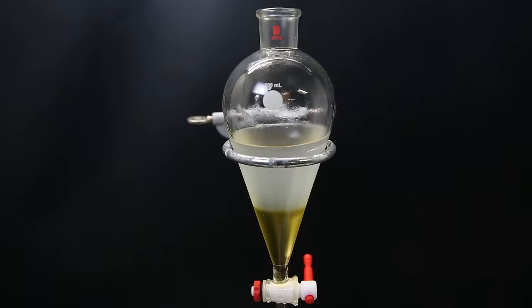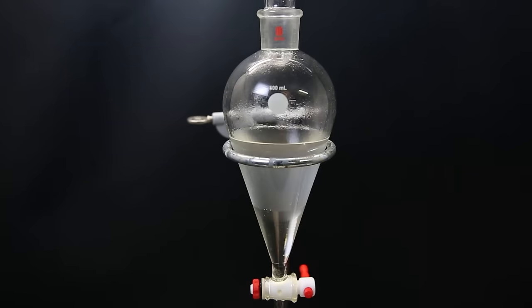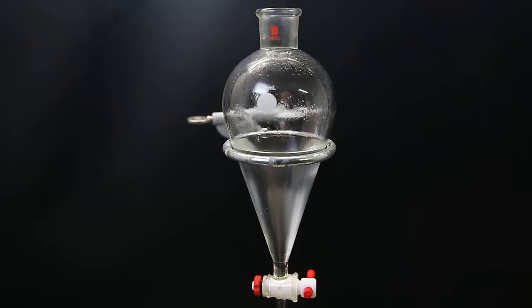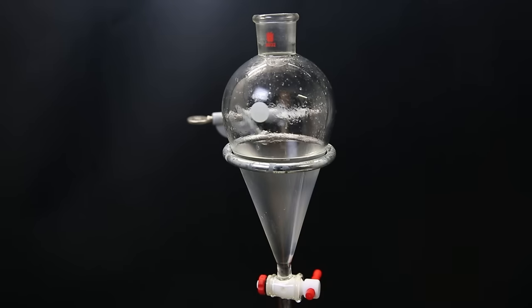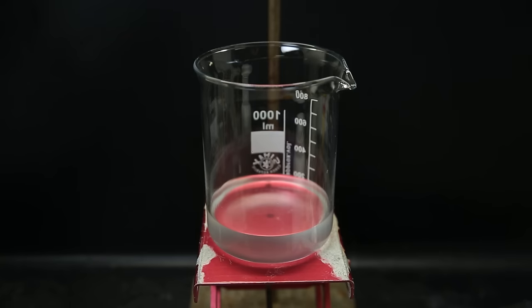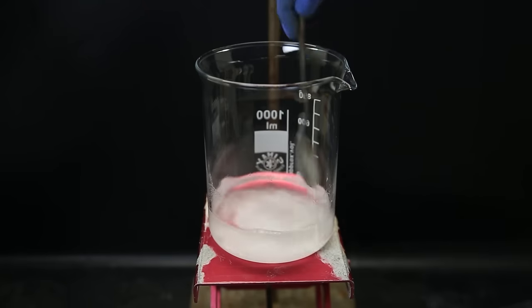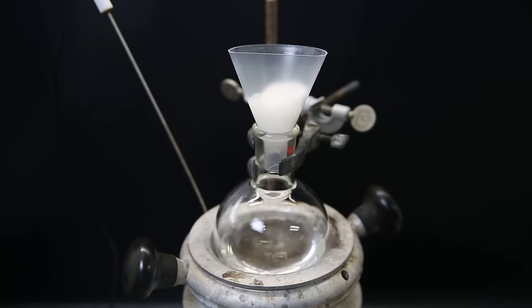I then wash the solution 5 times with a 10% sodium hydroxide solution, which we see takes out a lot of the yellow color. I then wash it once with brine to remove most of the water and put the washed ether layer in a beaker. I add some sodium sulfate to the beaker to take up any remaining water and then filter it all through some cotton directly into a flask.